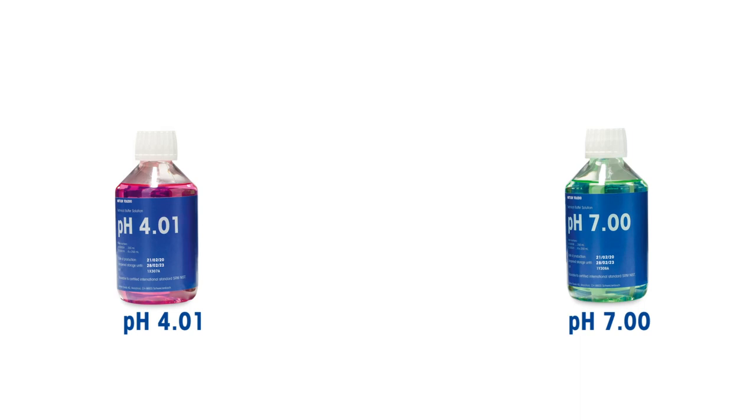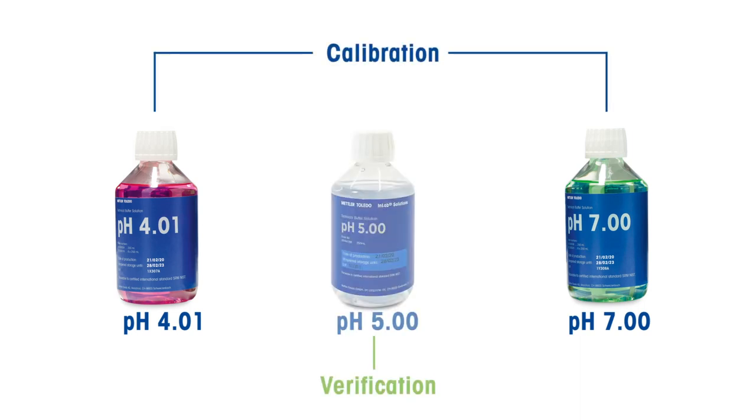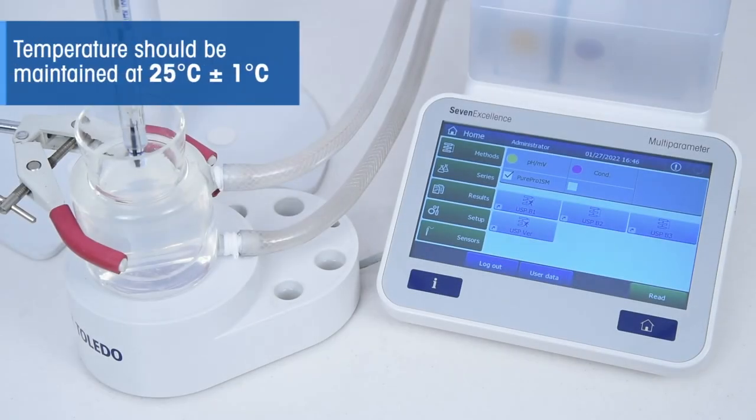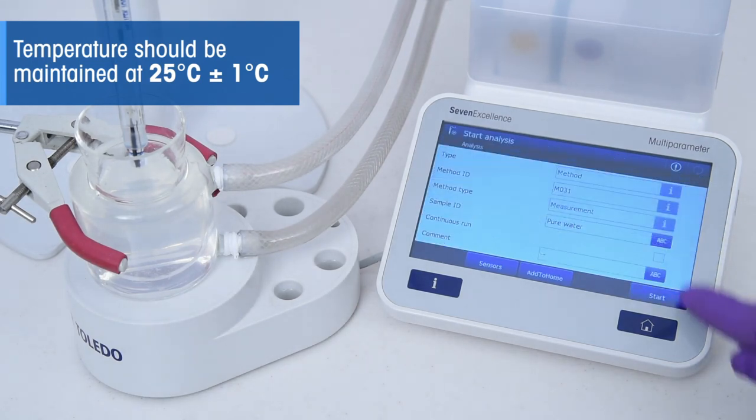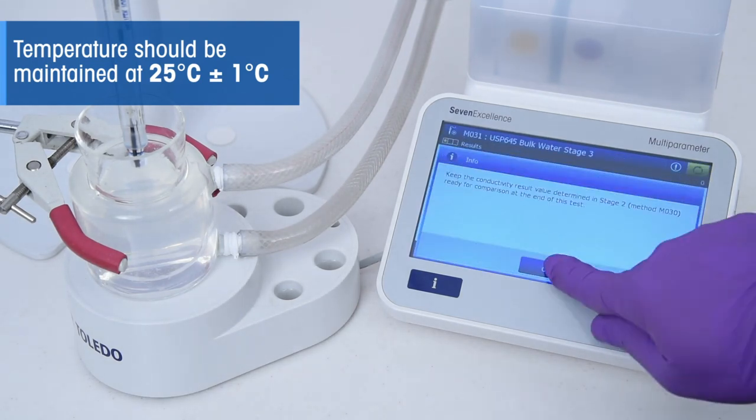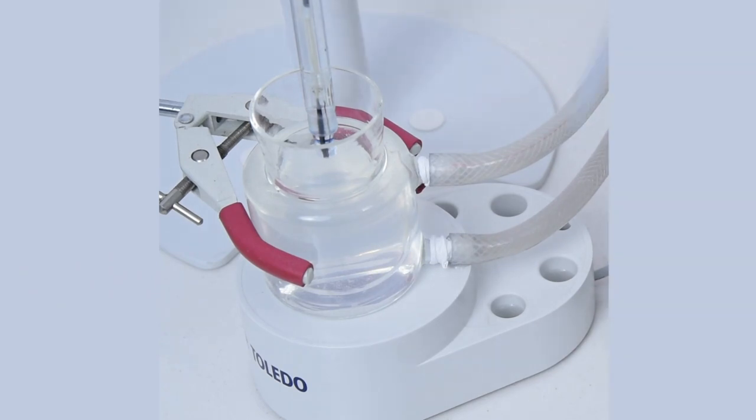For example, use pH 4.01 and pH 7.00 buffers for calibration, followed by a verification with an intermediate buffer, such as pH 5.00. Maintain the sample temperature at 25 degrees Celsius plus or minus 1 degrees Celsius and measure the pH after adding 0.3 milliliters of a saturated potassium chloride solution per 100 milliliters of sample.